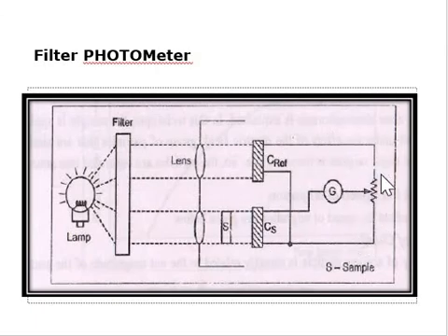Now we are doing some modifications and we are making the circuit neutral by changing this potentiometer value. By changing this potentiometer value, the galvanometer starts reducing and at some point it will become zero. So that zero point will be the value. That point will be compared with the previous value before the sample is placed. The change in value between the normal value and the reading taken after the sample is placed gives the ionic concentration of the sample solution.